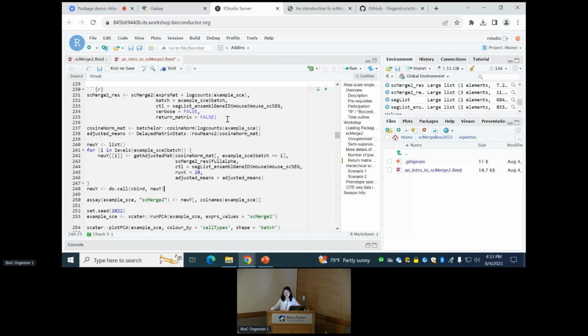Right, but you're using a portion of it at a time and then completing the rest. I was concerned because when I ran this with the old algorithm, I couldn't get it to go through memory. I was interested in the optimization, but that explains it.